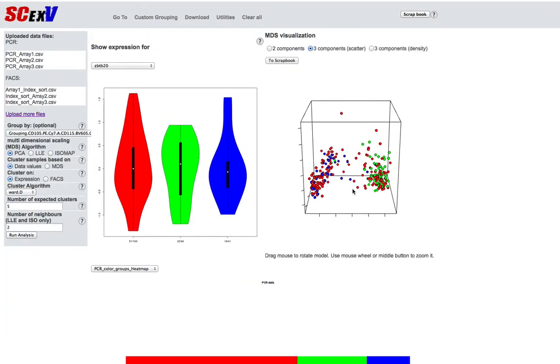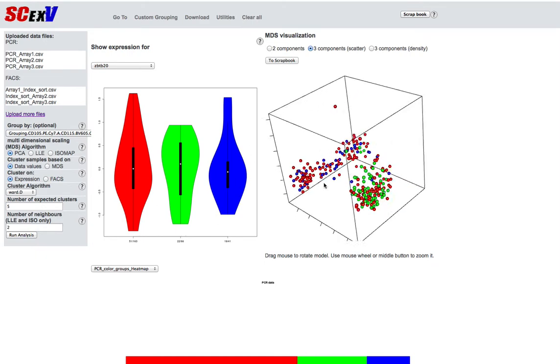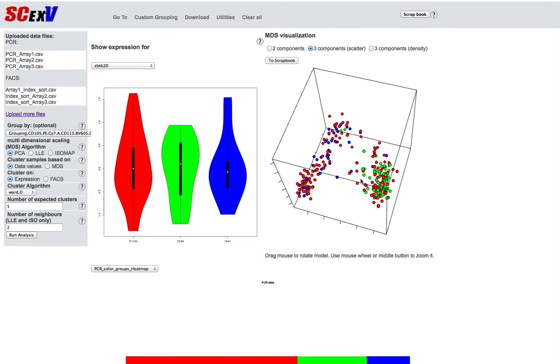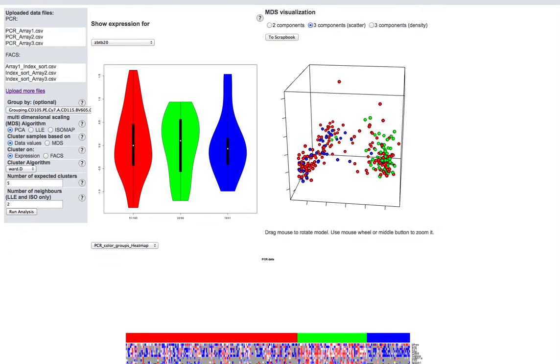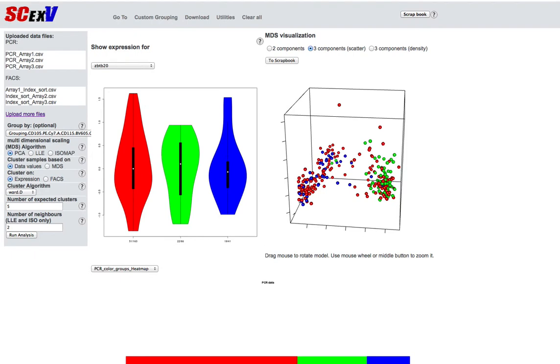So once that has been done, you can see that the colors have changed, and we can see here that our blue and our green selected plots, or points rather, fall into two different areas. So again, it's a very good way of gating out cells and looking to see what they do over a PCA plot. And again, we can do the same thing looking at our heat maps as well.